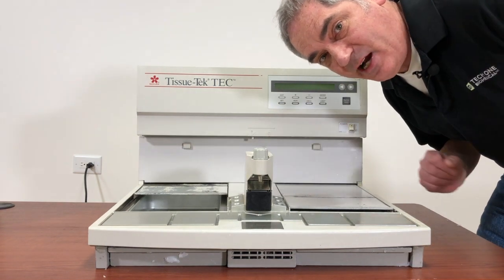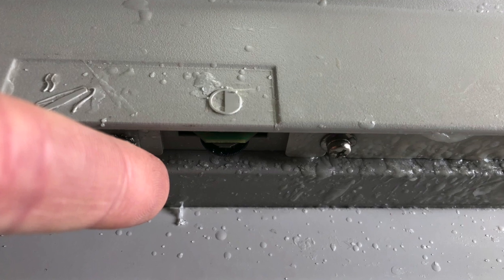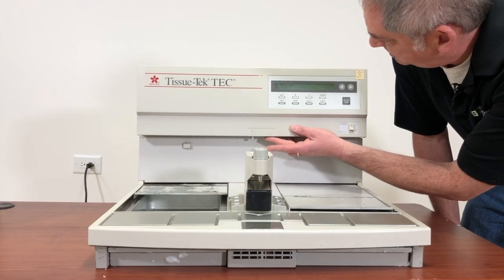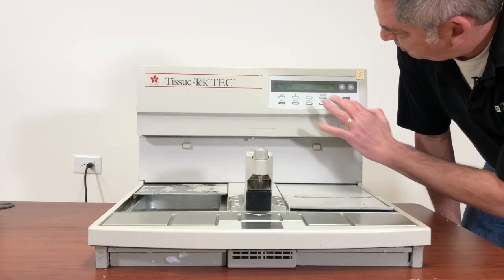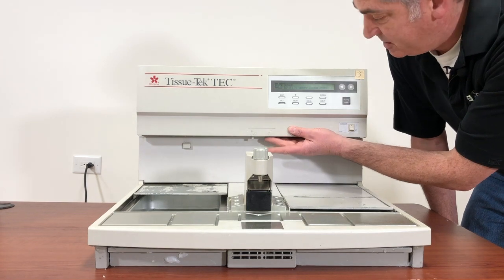Tissue Tech embedders have a knob under here that a lot of people don't know about, and its only purpose is to change the brightness and the contrast of the display. So, that's the fix. Turn the knob.